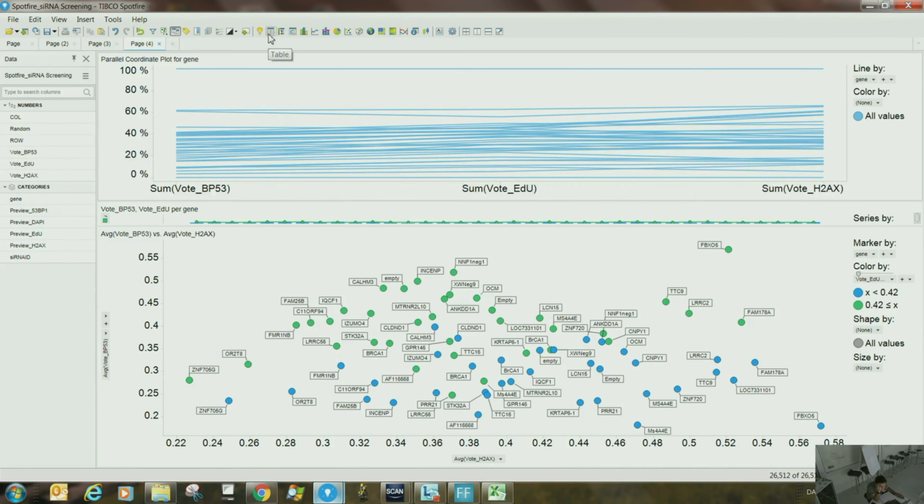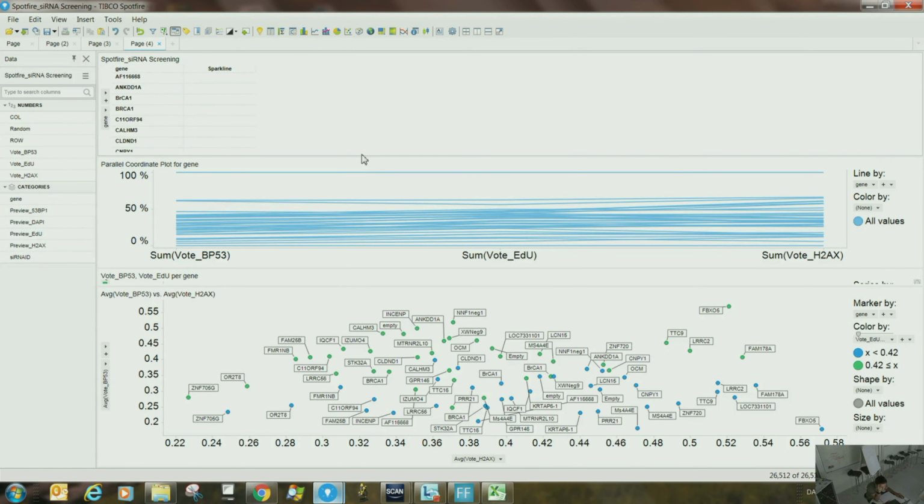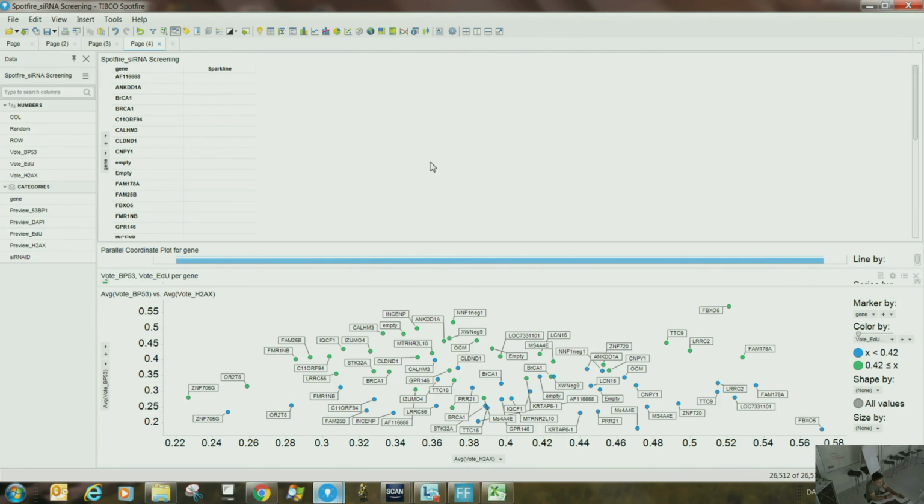The final part is the box plot, but before that, what is this? Graphical table. Well, graphical table is hardly something you would use, but let's see. The graphical table is basically a table, but within the table, instead of just having a numerical value, you can have pictures, or you can have a line chart and things like that. That's a graphical table basically.